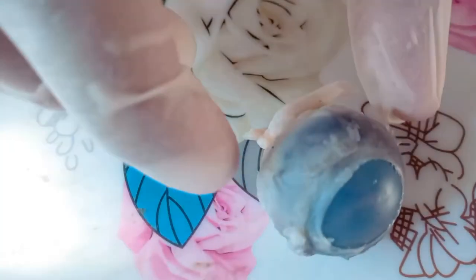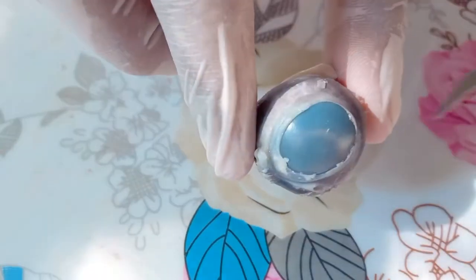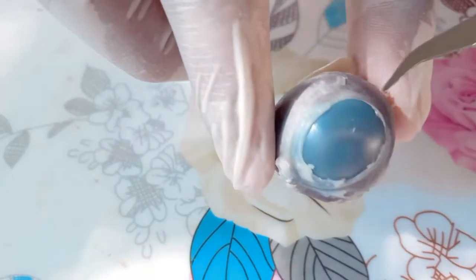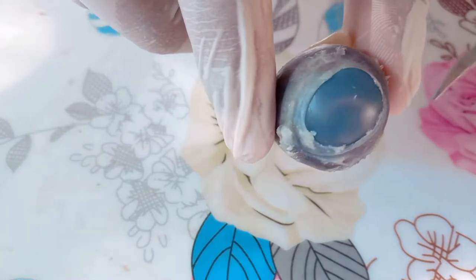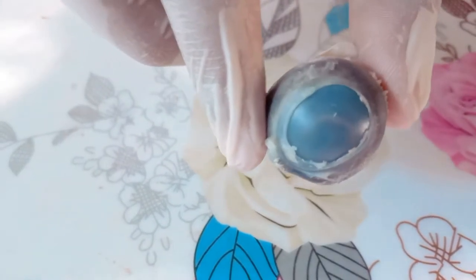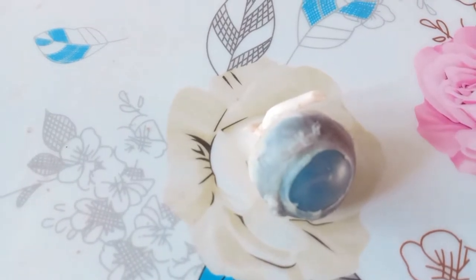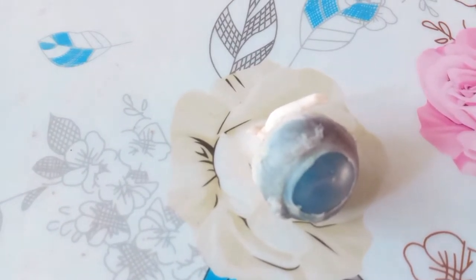This is the outermost layer. This is tough, opaque, and white in color. This layer is called the sclera. This is the front portion of the sclera. This is transparent and is called the cornea.